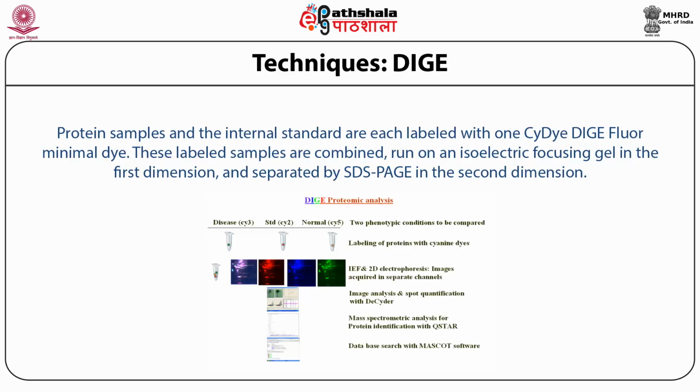Internal standard is used to normalize the expressions and also for in-gel comparison. After labeling, the proteins are mixed and subjected to isoelectric focusing, equilibration, and SDS-PAGE.